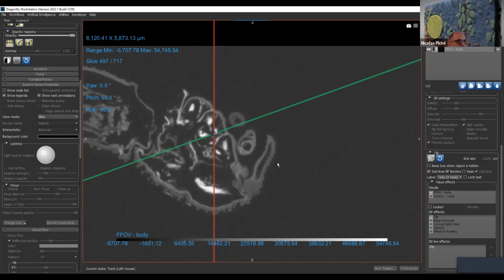You position your spot, you choose your oblique, and after that you derive a series. After that you select the slice. You generate a new 16-bit image, and when you go to export, it will ask you if you want to apply the level, the brightness and contrast. So you will have that slice on that oblique. But it's true that it should be one click instead of multiple clicks.